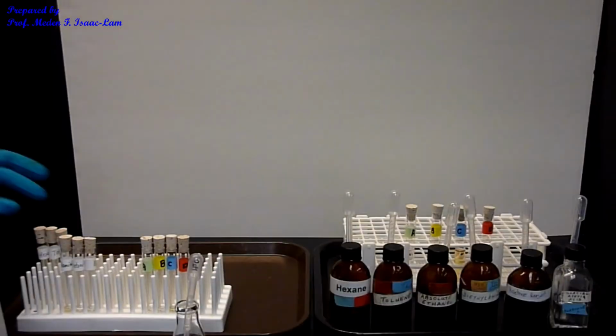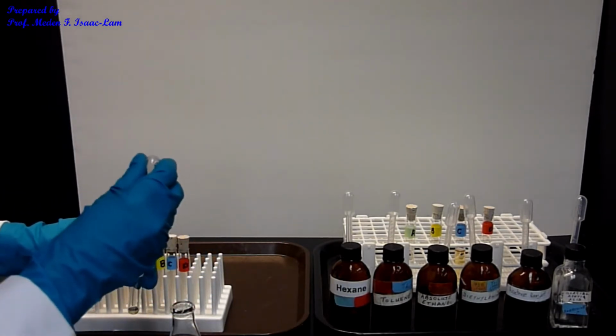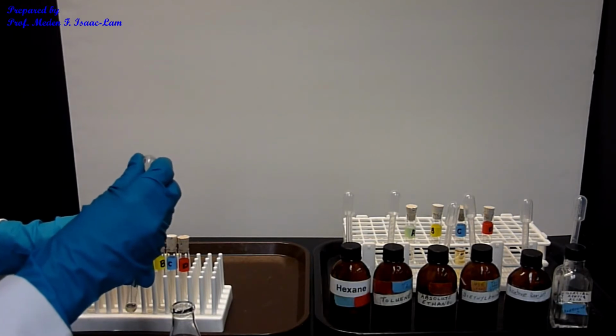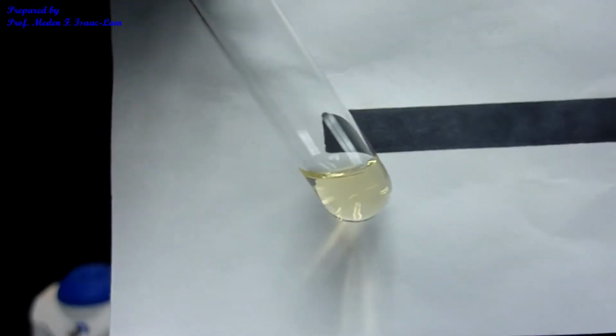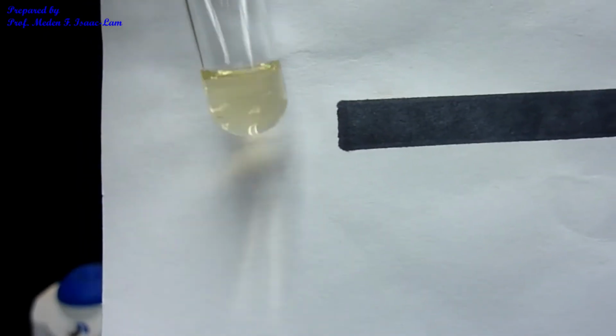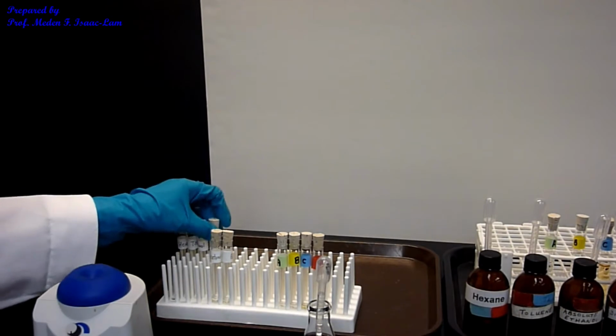All right. Now next one is diethylamine. Again, 10 drops. I'm going to mix it here. Do you see a layer or no? And now acetone.